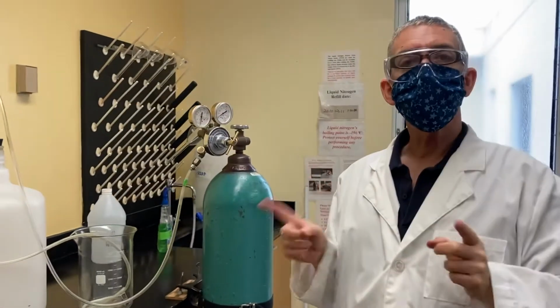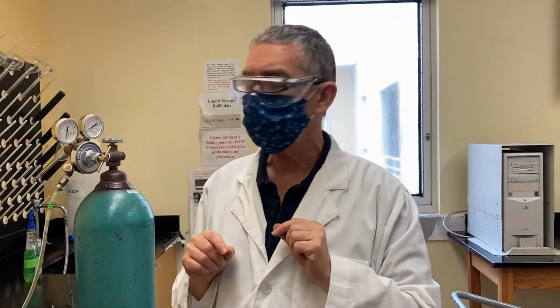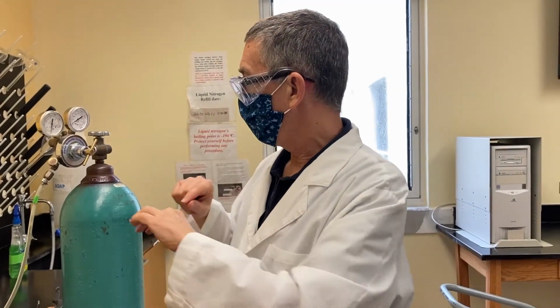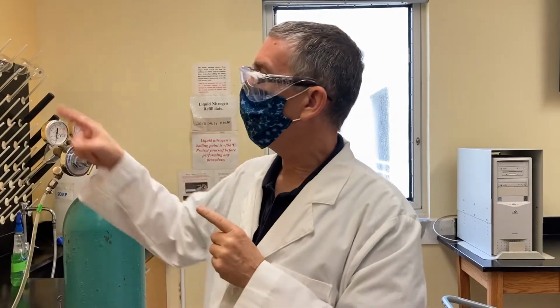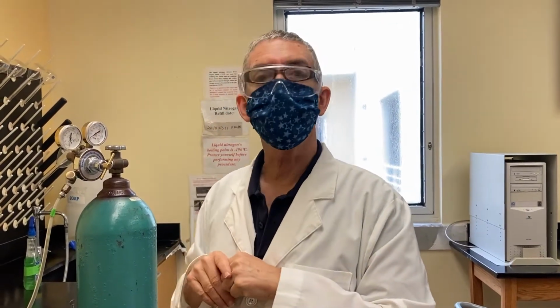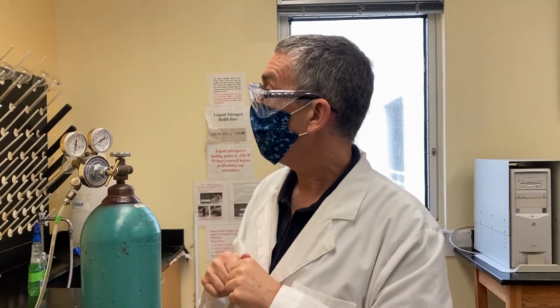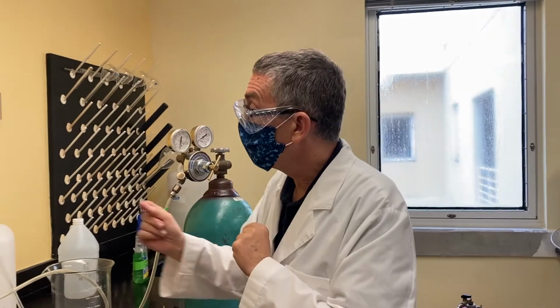Now, the very first thing I recommend you do after you measure the barometric pressure is to do nothing with gases and nothing with water. Just think through the apparatus and think through the steps. Much better to make mistakes that are only in your mind, okay? I also recommend you do that though with your fingers a little bit.